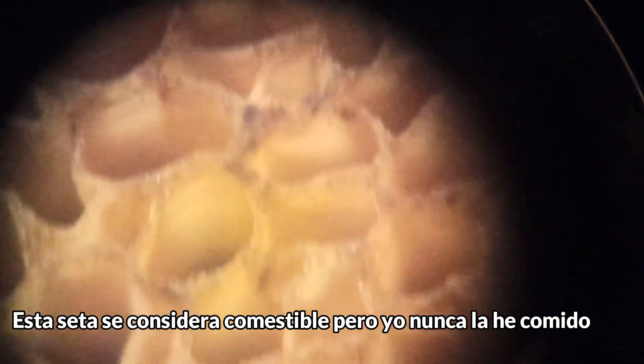A little more of the amount. How cool, eh? Some little cells. What does it remind you of? It reminds me of honeycomb from bees.